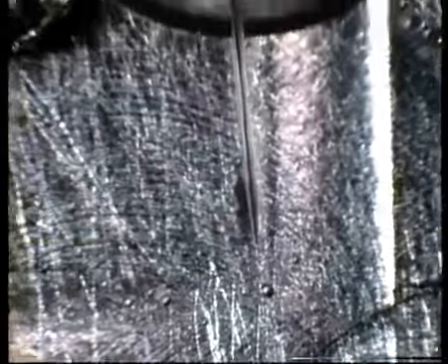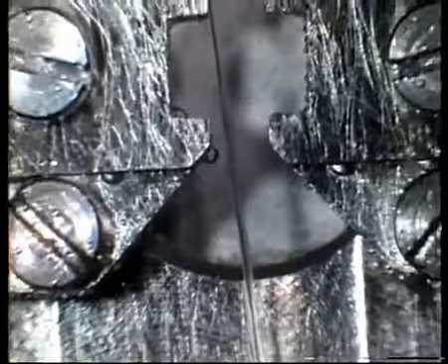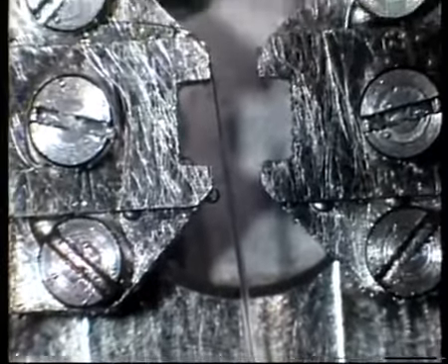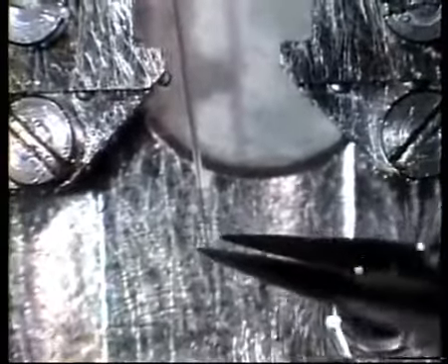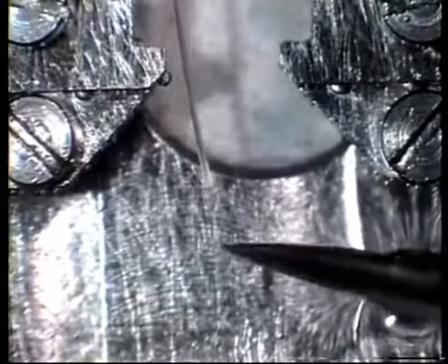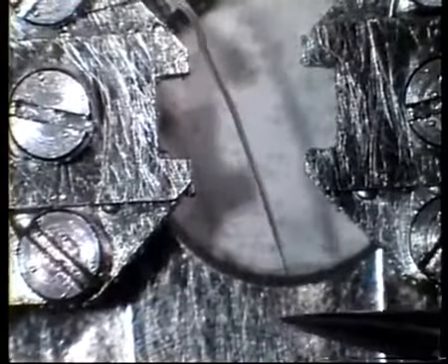When the distal end of the vessel reaches the wire tip, it is pushed onto the wire. The end of the vessel is closed from when it was cut, and if you tried to pull it onto the wire, it could stretch the vessel and induce a contraction. In order to have enough space for the artery to pass, the heads are moved apart and the wire is bent out. The vessel is now gently pulled further up the wire.